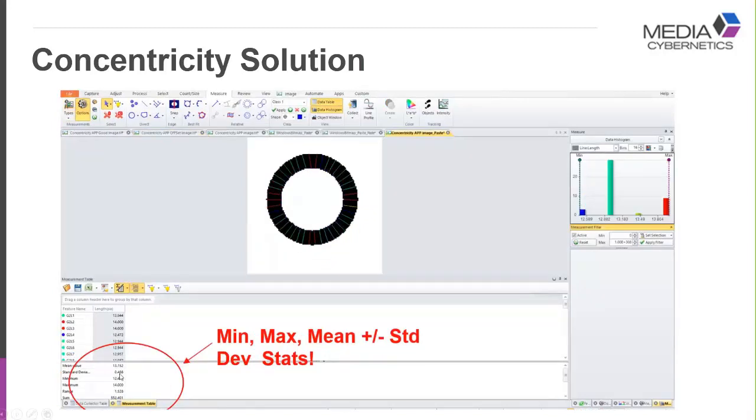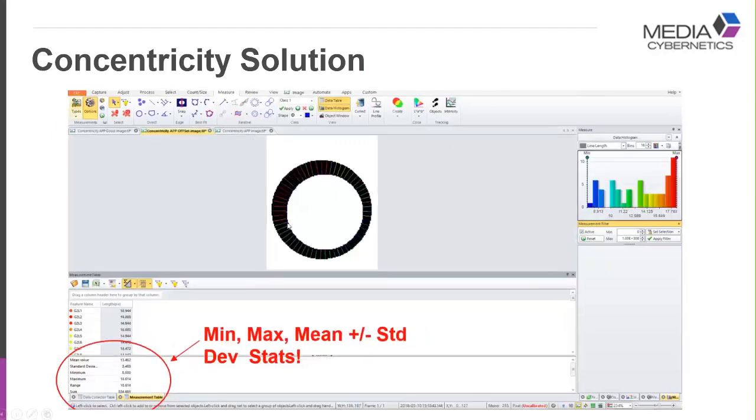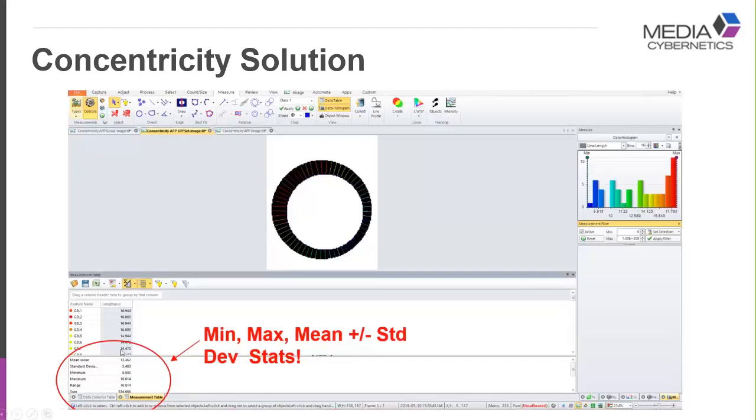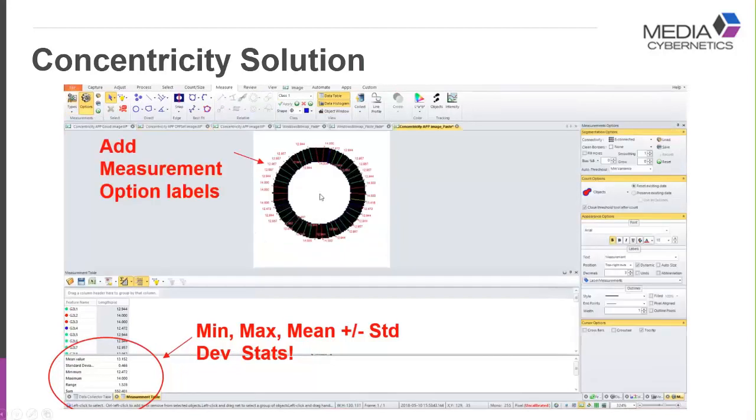Here's the next image where it is nicely centered. The numbers here for standard deviation is 0.5, the range is about 1.5. In the previous image where they were offset, standard deviation was like 3.5 and the range was like 10 or 11. So you can see that the numbers reflect the concentricity or non-concentricity of a sample.